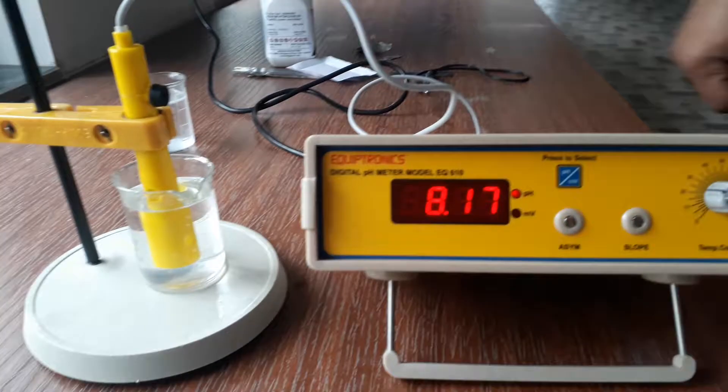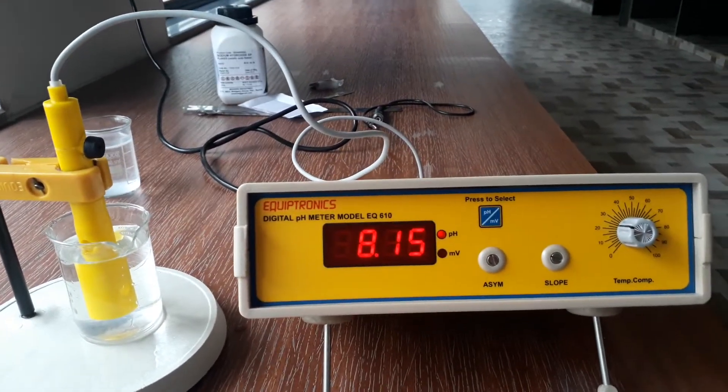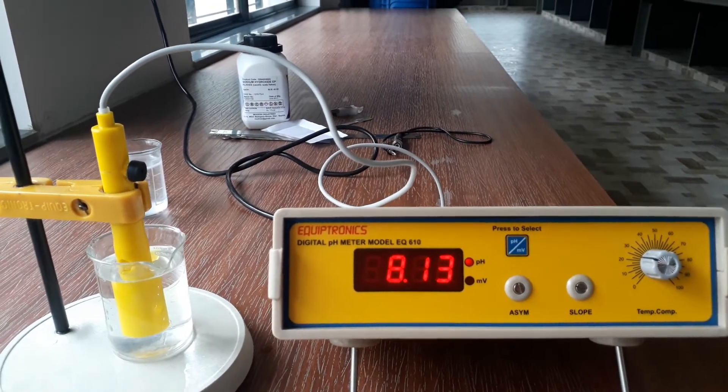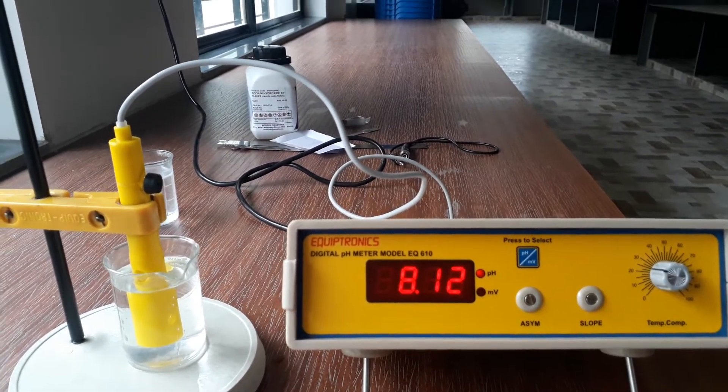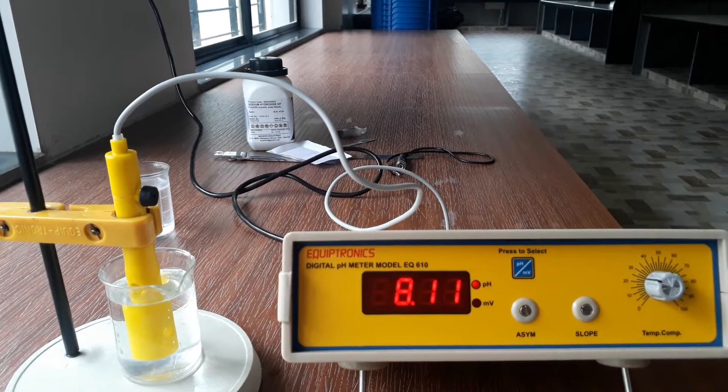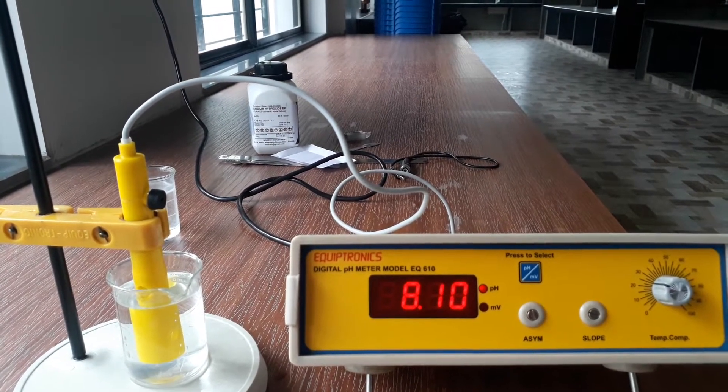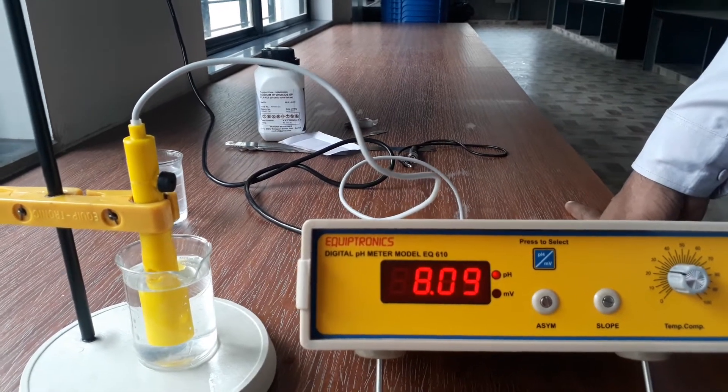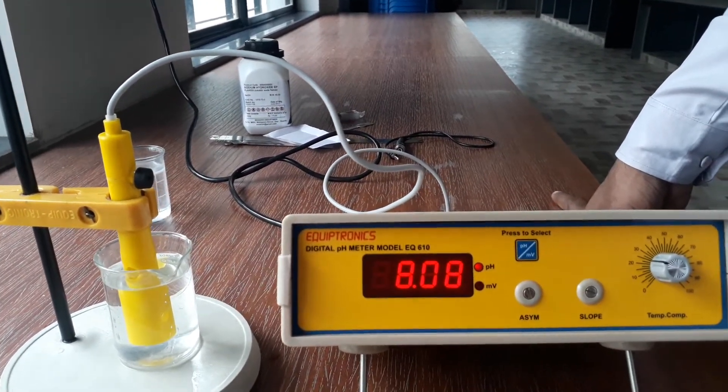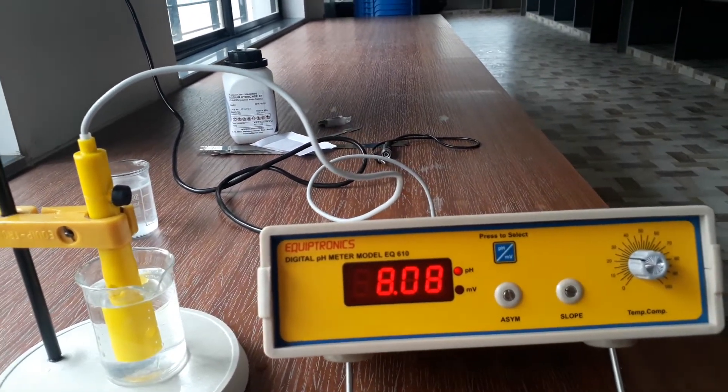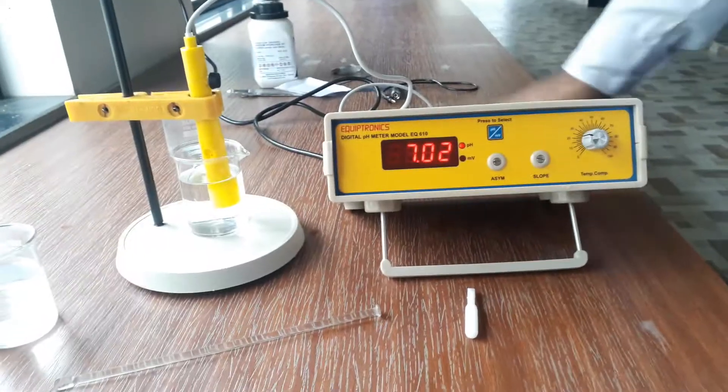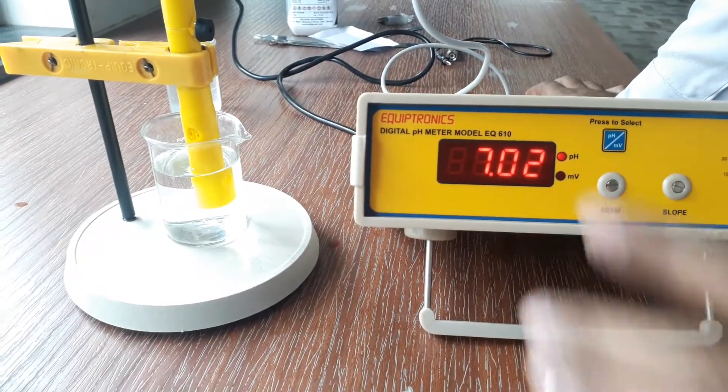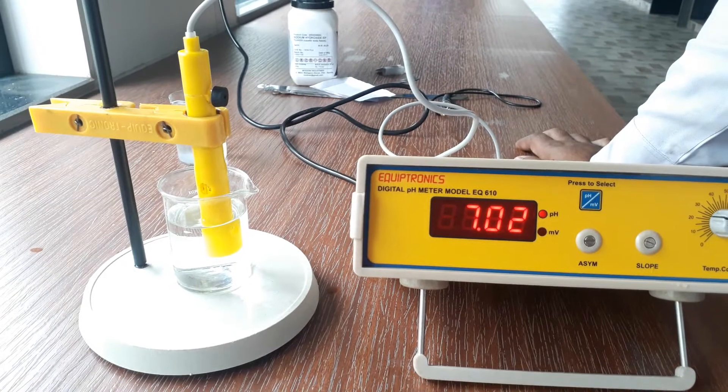You can see the pH value has started to decrease. So it should come nearly up to 7. After some time we will see it will become 7. Now you can see the pH value on this pH meter is 7.02, means nearly 7. So distilled water pH is 7 which is recorded exactly in the pH meter.